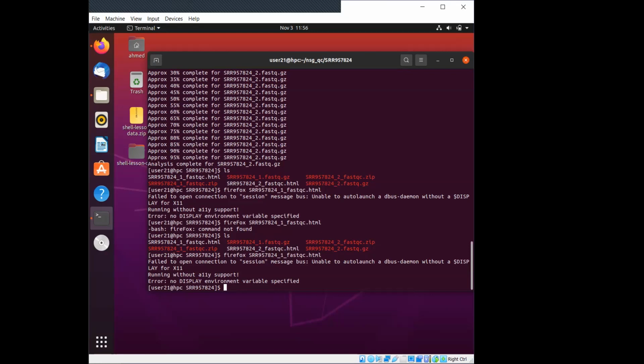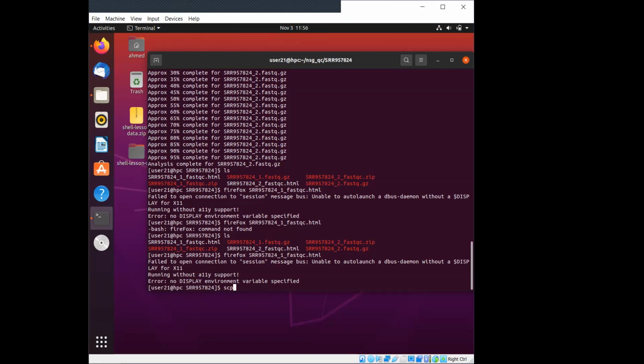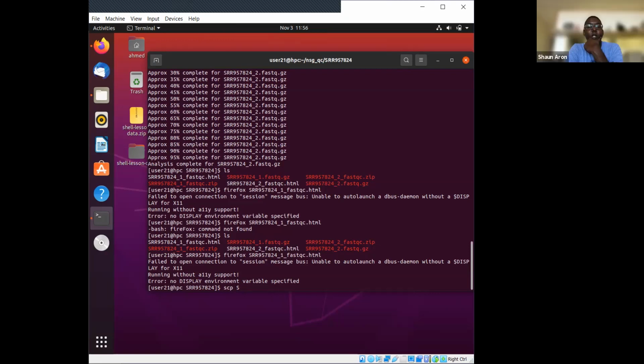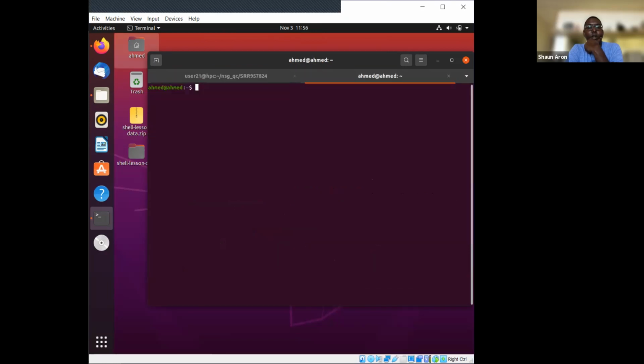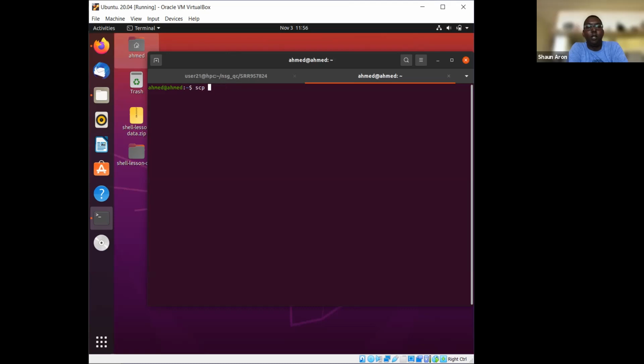How do I do that? Remember I said SCP? But you need to open up a terminal on your local machine. Oh, okay. Yes, you need to be on your local machine. Okay, so you're on your local machine now. So it's SCP space, and then your user at whatever your username is. Not Ahmed, the one you're on the cluster. User 21, it seems.